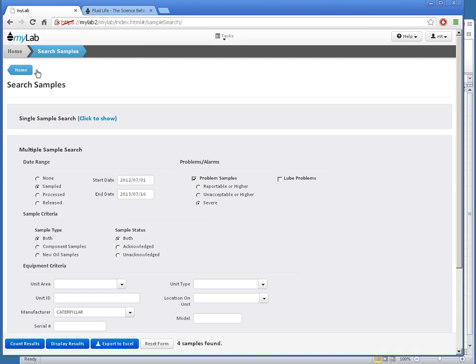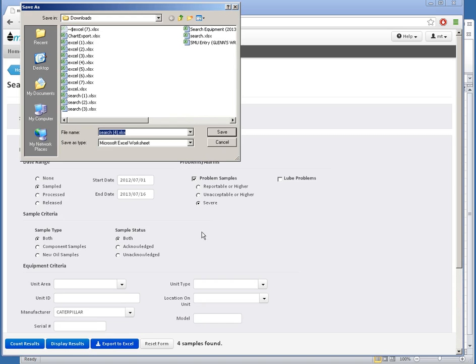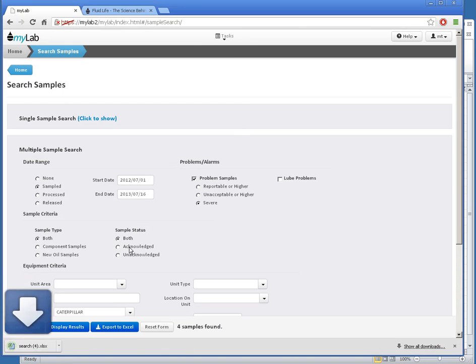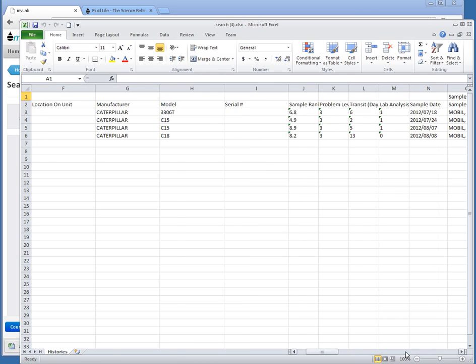To export all of these, I'll click the Export to Excel button here. Opening that file, I now have all of my search results.